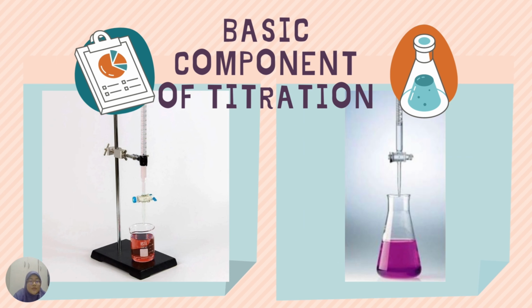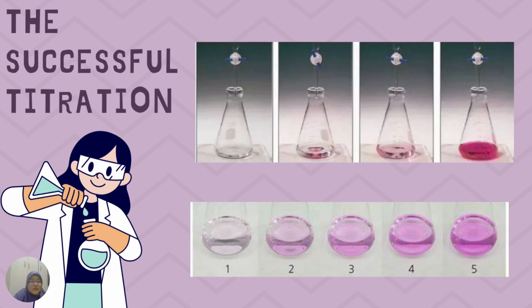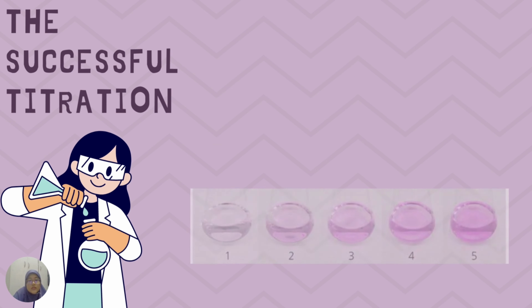This is the apparatus that we need to put. In a successful titration, the colorless solution turns into a pinkish or purplish color after adding the titrant.